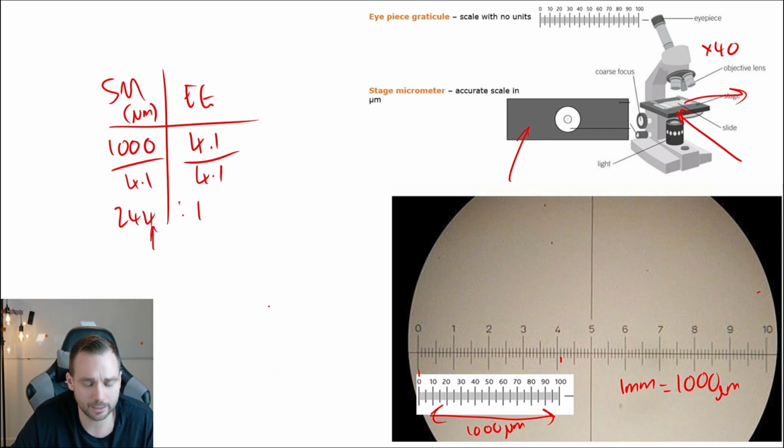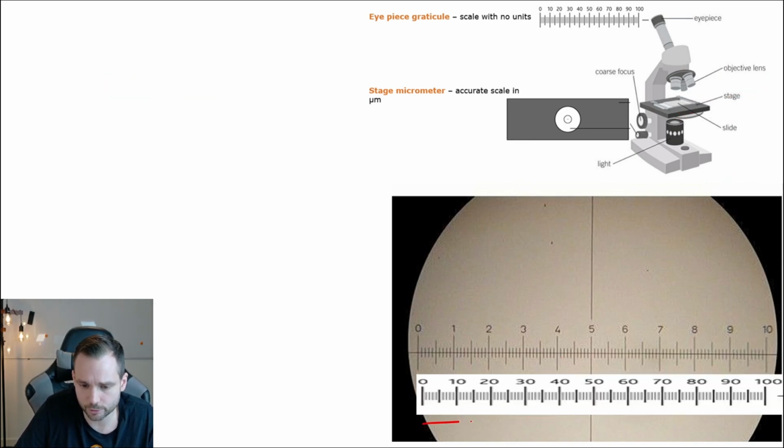If we're working in a biomedical lab and we're observing tiny, tiny bacteria, we need to make sure that we're measuring the correct length of them, because that's going to help work out what bacteria that is and maybe diagnose a patient. So this was at ×40 lens, and now when we increase the magnification, when we rotate the objective lens and put in the objective lens ×10, well, I've got ×10 in the eyepiece all of the time, so now we're going to go up to ×100.